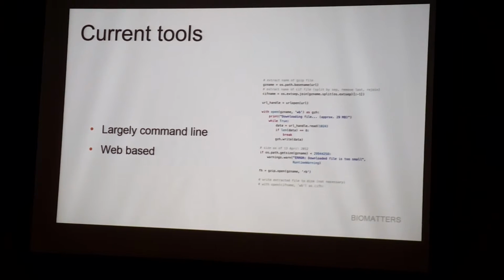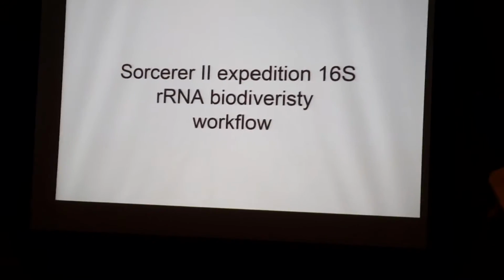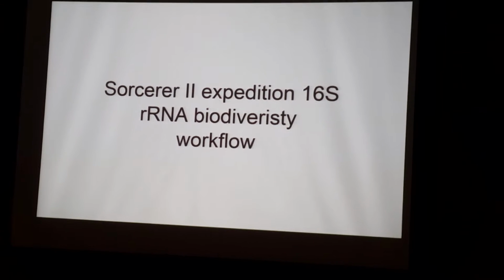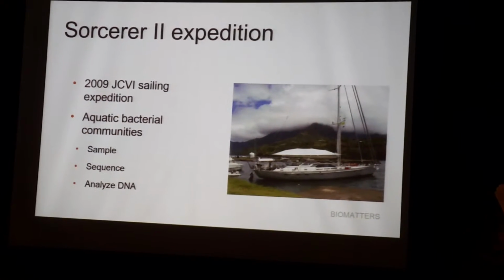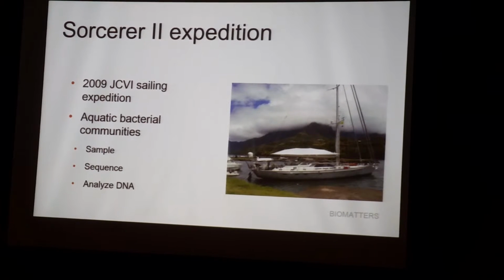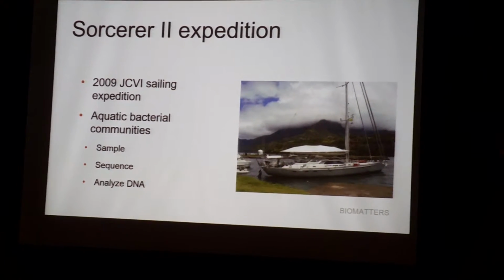So today I wanted to use an example called the Sorcerer 2 Expedition, a biodiversity workflow, to highlight the tool. I'm not sure if any of you are familiar with the Craig Venter Institute, but they commissioned an expedition around the globe to collect water samples, 200 to 400 liters every 200 miles.